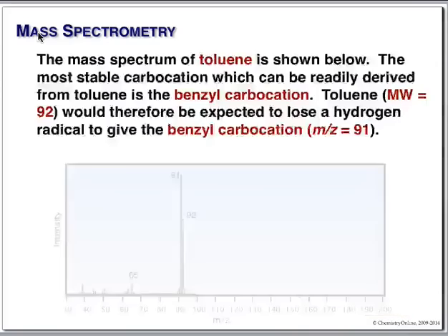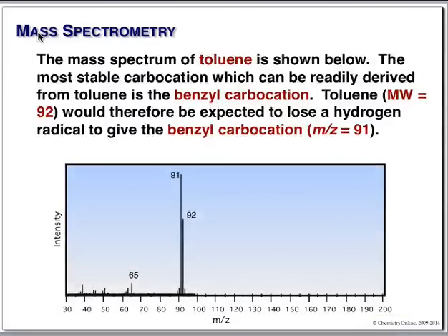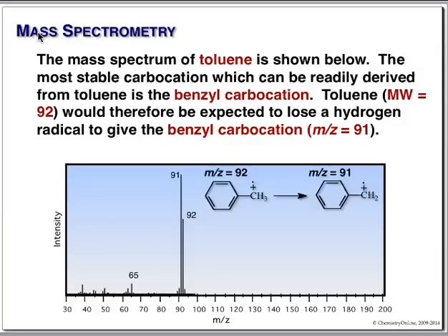Okay. Toluene. Toluene is methylbenzene. If you add up the molecular weight of methylbenzene, turns out that its mass is 92. So 92 represents the molecular ion, and that's this guy. The next peak we see, the base peak, is 91.